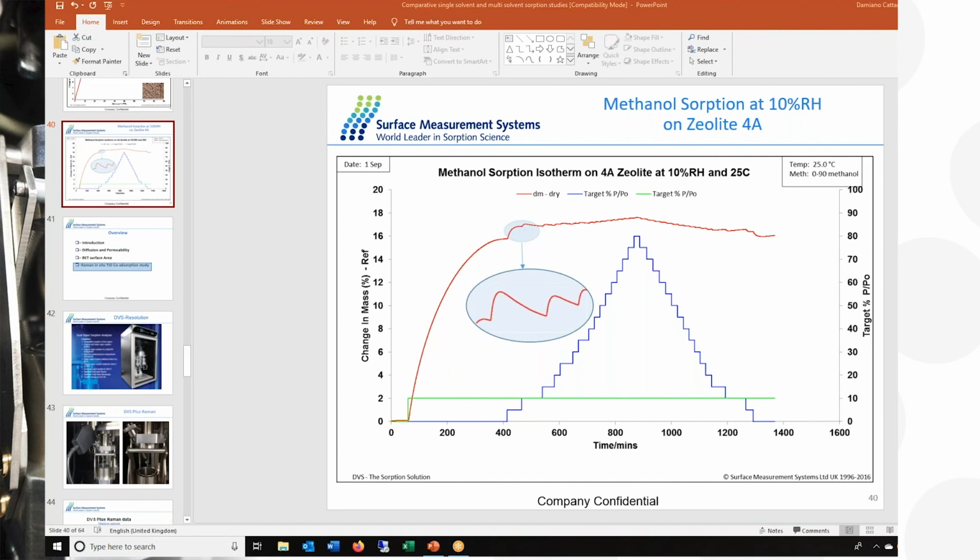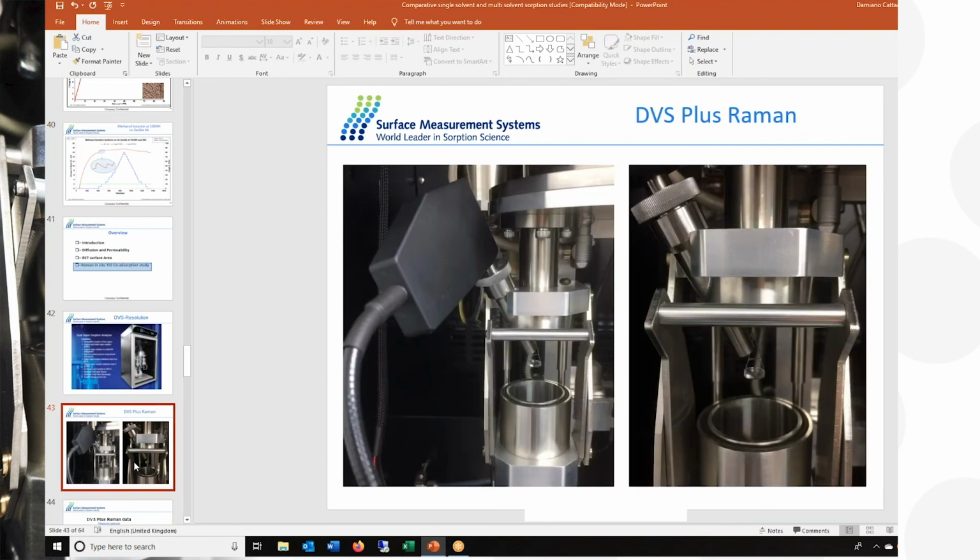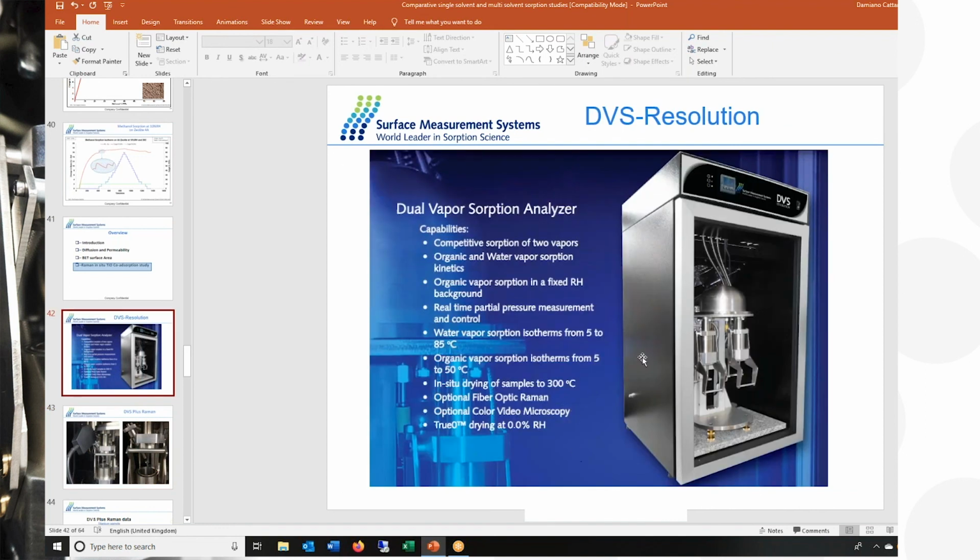Yes, so the Raman I used to collect this specific set of data that I presented today is a B&W Tech Raman. We are not a manufacturer of Raman; we purchased it from an American company called B&W Tech. In this case, we are using an i-Raman Plus with an in situ probe. That's the in situ probe that you see over here. The Raman sits right next to the incubator on this side.